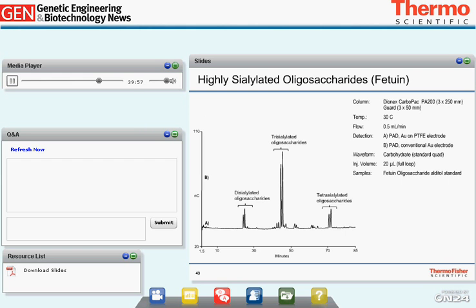The Carbopac PA200 is the best column for oligosaccharide analysis. This shows the separation of bovine fetuin — a highly glycosylated protein (25% glycosylation) with abundant sialic acid. The major peaks are trisialylated structures. The two major peaks differ only by the linkage of sialic acid: one has alpha-2,6 and the other alpha-2,3 linkage at the same position — a linkage isomer. These are resolved using an acetate gradient, demonstrating the high-resolution capability of HPAE-PAD for separating linkage isomers.